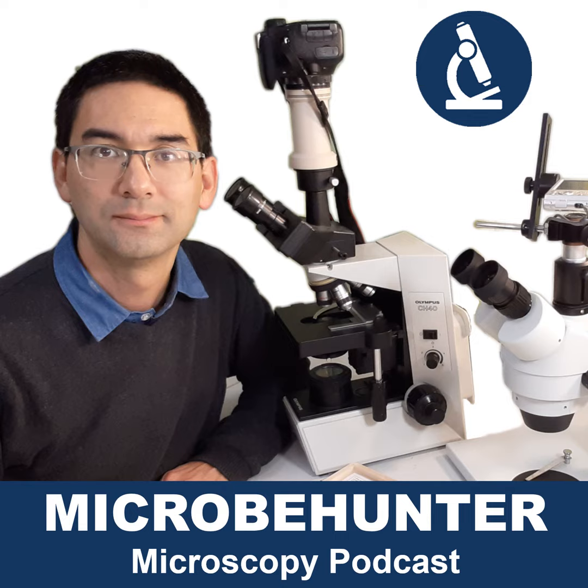This basically means that if you want to see those details, you've got to look through the microscope, because the optics and the human eye really give you the maximum dynamic range that is theoretically possible to be seen. Unless you use some specific digital processing techniques like high dynamic range imaging, where you take several pictures and combine them on the computer, microscope cameras don't have the full dynamic range yet. And this is also one of the reasons why you do not want to make microscopes that only rely on a camera. Okay, so that is basically all I wanted to say now.